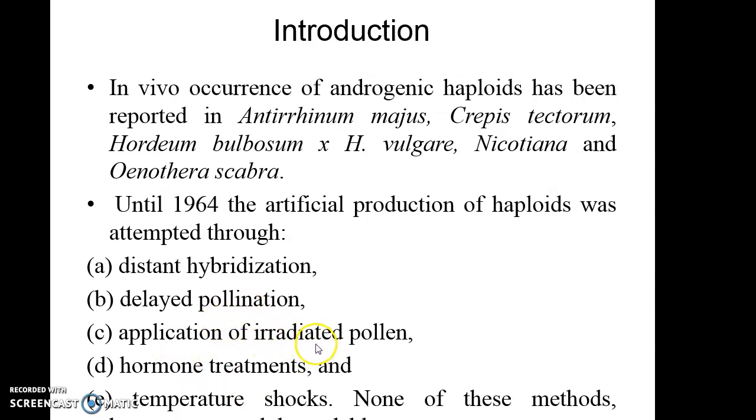That means you irradiate the pollen grain with X-rays or UV rays. But these methods are not reliable or reproducible.